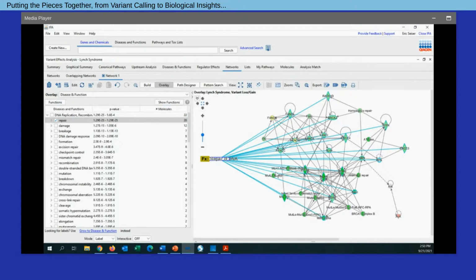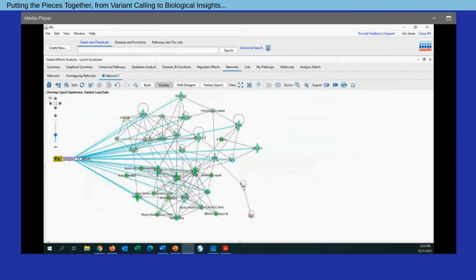So that's one kind of quick interrogation of this data, looking at what's in my study. But to get to our final point for today, we might now ask the question, with this observed network and the pattern of loss of activity or loss of functions of these genes in this network, do we see this signature show up in expression data in public studies? And to answer that question, we'll simply click on this button here for pattern search.